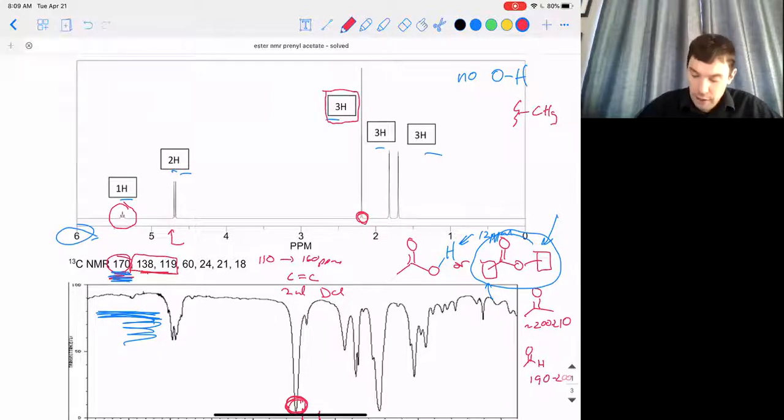And not only that, usually the chemical shift of that methyl signal will be quite diagnostic, and we'll be able to make a pretty good guess as to what kind of methyl it is based on the chemical shift. All right, and so in this case, that looks like it might be at about 2.2 ppm to me. It's definitely above 2, and it's definitely well below halfway up to 2.5, at least based on the hash marks we're given. And that's a really important range.